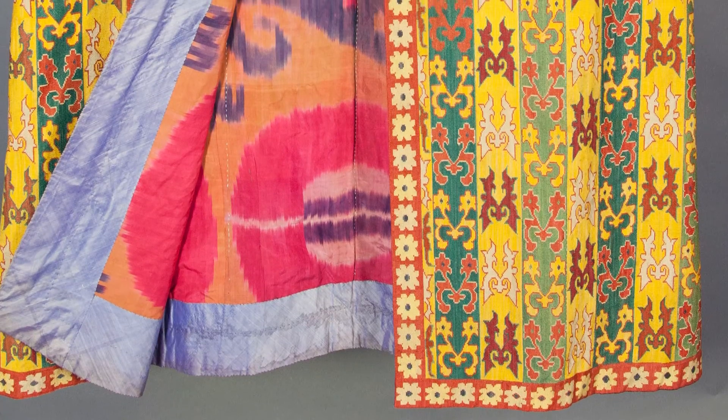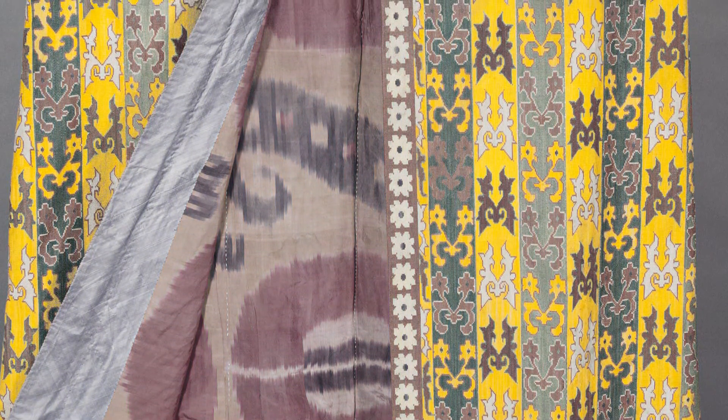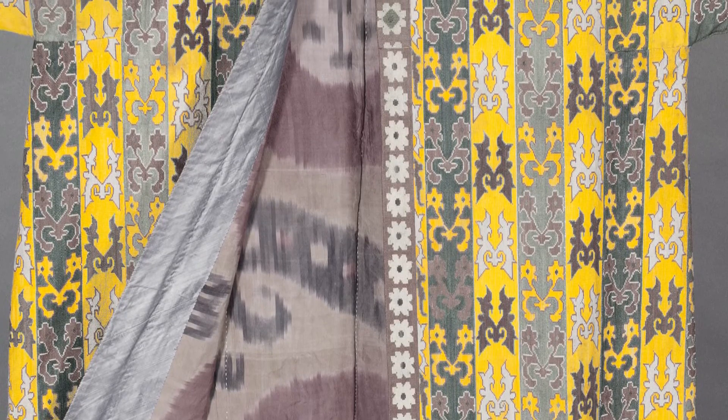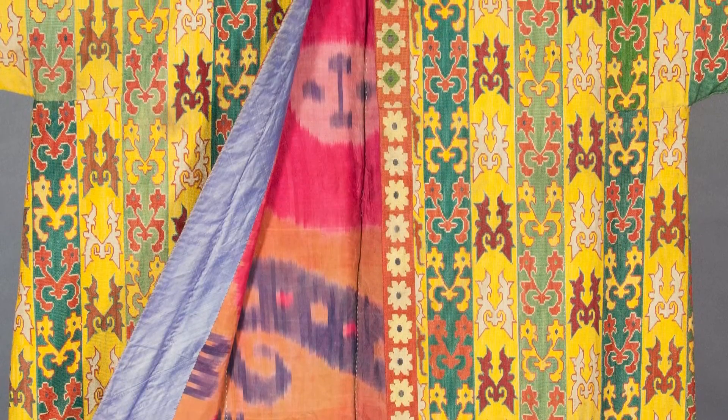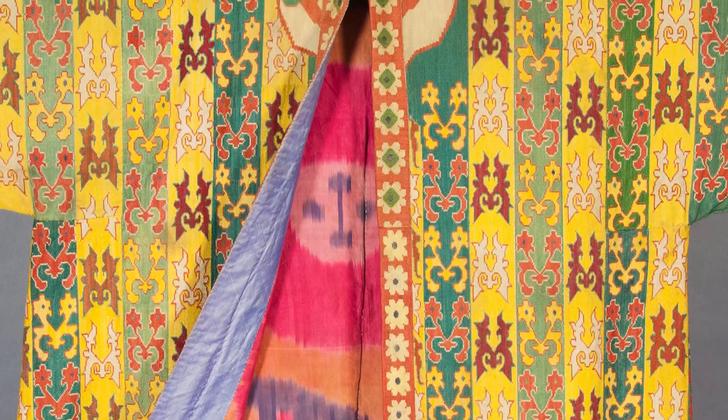In this instance we find that there's a mixture of both natural and synthetic dyes. The yellow seems to be a material called berberine, which is a natural dye stuff. However, the blues and the greens are synthetic dye stuffs, and because they were manufactured in a lab there are records as to their earliest discovery date.